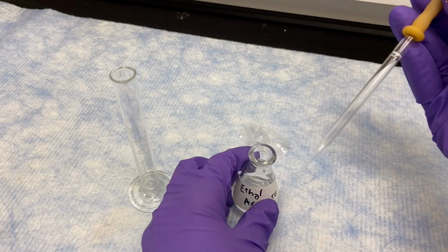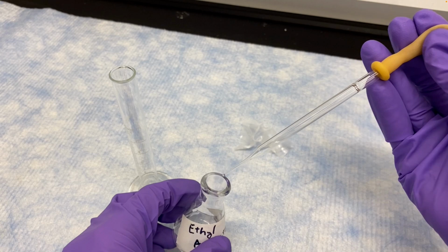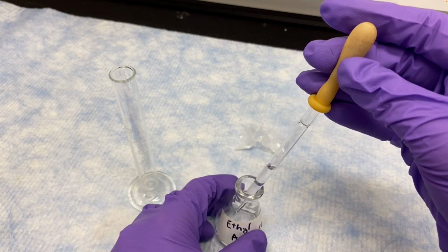And then when you pipette something, as far as good technique goes, the first thing you want to do is always squeeze the pipette bulb before you put the pipette tip into the liquid. If you put the pipette into the liquid first and then squeeze, which is a very common mistake for beginning students, it'll squirt out air, which will cause bubbles, and it'll splatter the liquid. So a good technique is you squeeze that first, then you put it in the liquid and draw it up.